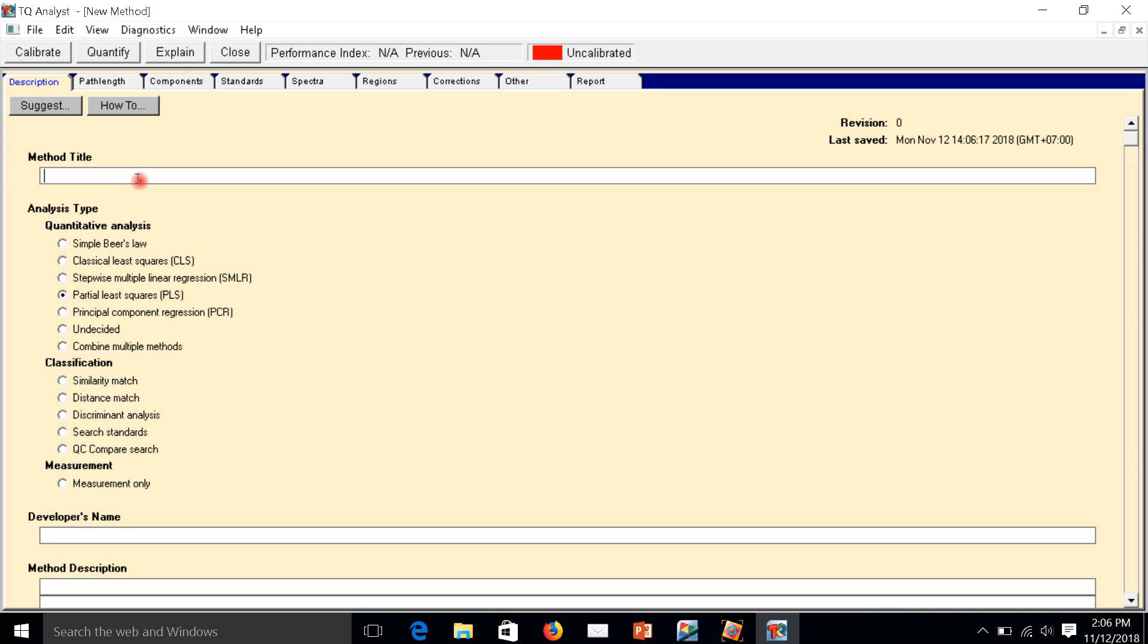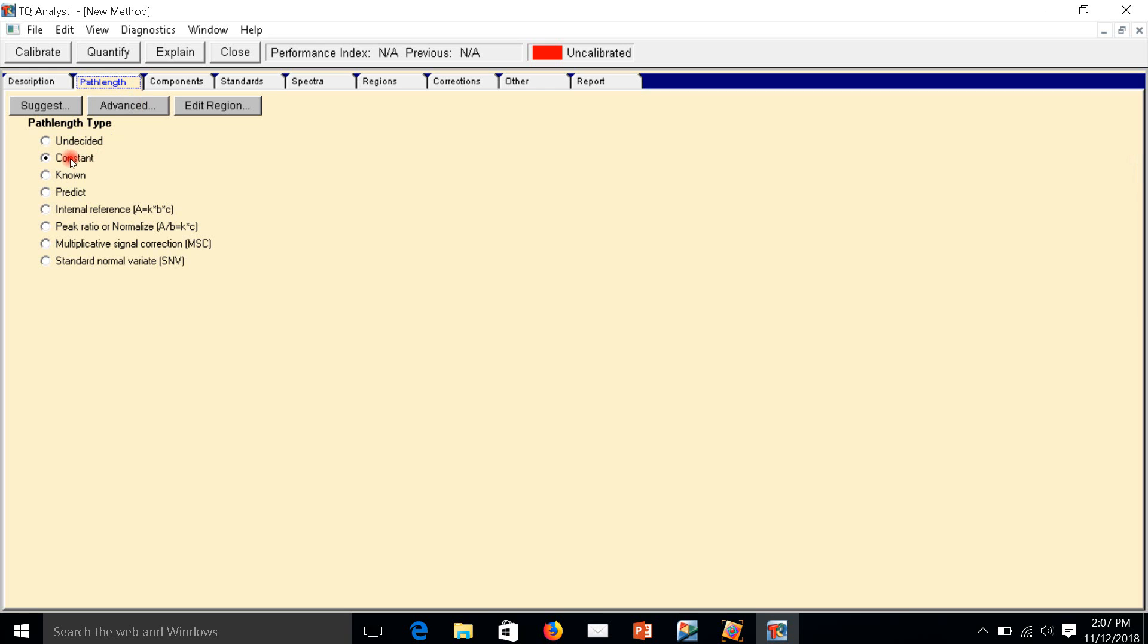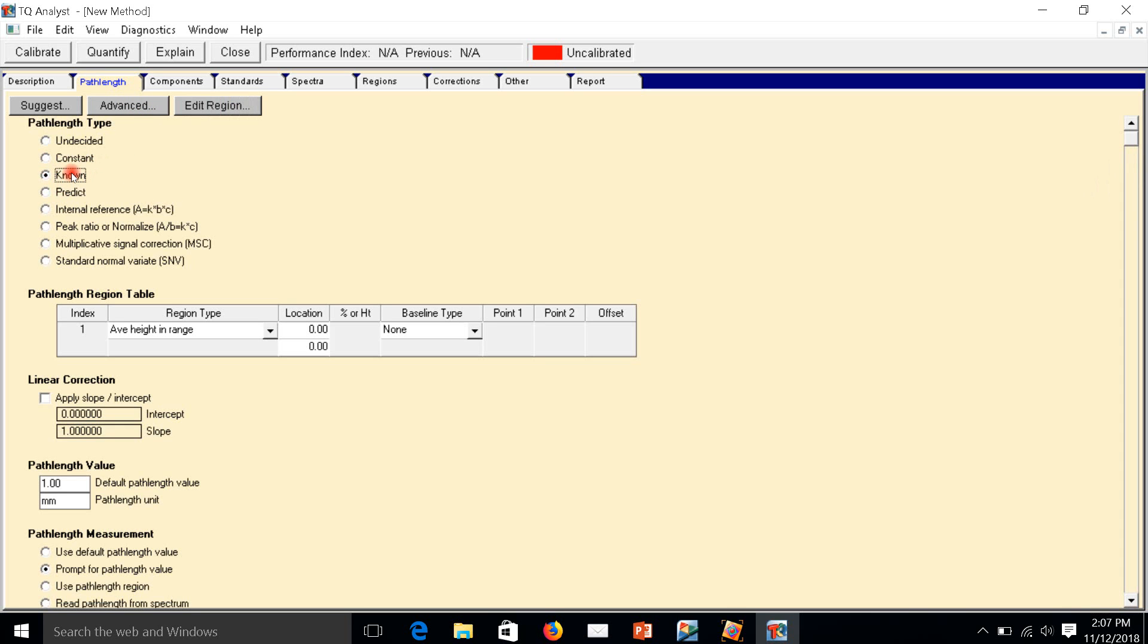The title depends on your application. This is my name. The path length, I choose constant because I have a constant path length, which is the diameter of crystal ATR. I just choose constant. If you don't know, you have to choose known.